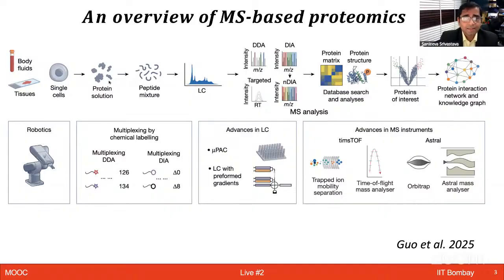But the current state of the art is that you can take any samples, and people are even targeting single cells, to think about how applications can be done at the single cell level, especially when you think about cancer tumor heterogeneity and many other biological applications where every cell itself has a lot of its own property. And when you pool different types of cells together, it may not give you meaningful data.